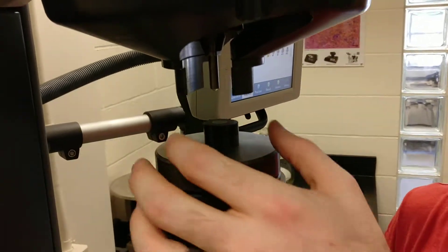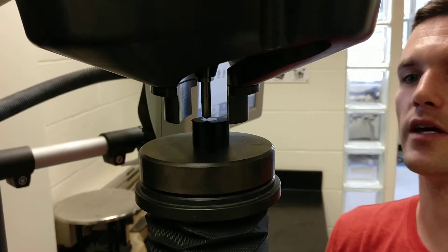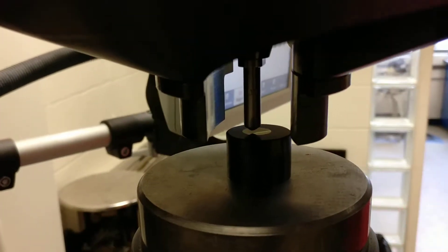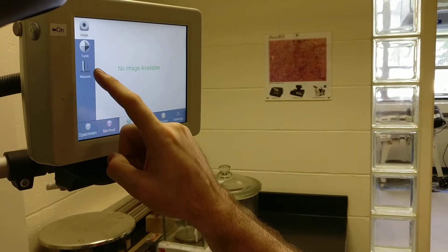Put your sample in there. I'm going to raise it maybe two millimeters below the indenter tip — you can kind of see the reflection of the indenter on the metal surface as well. I'm going to choose the HRB scale here, then go to position and hit measure.